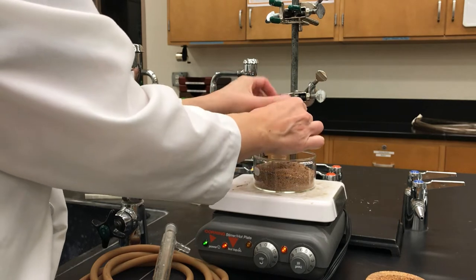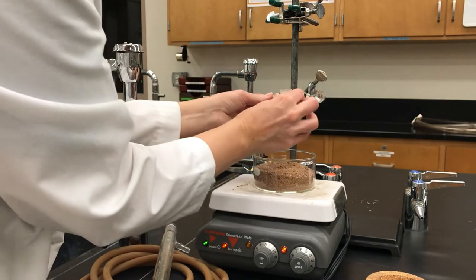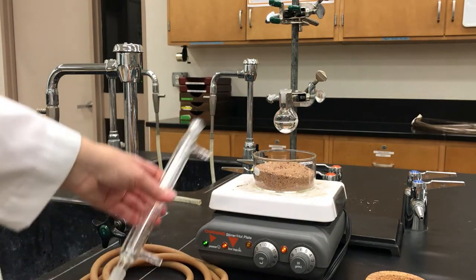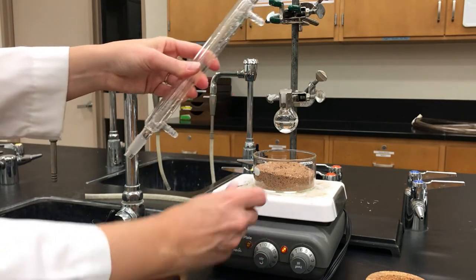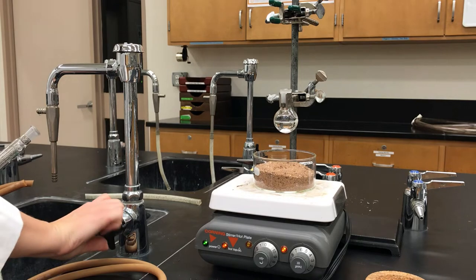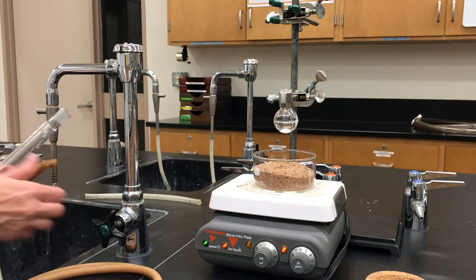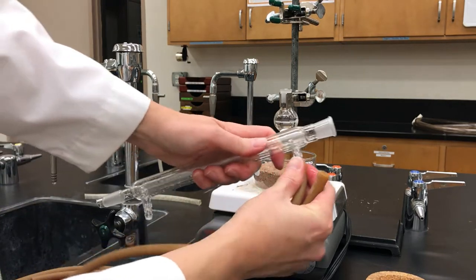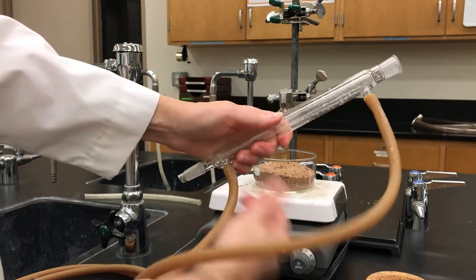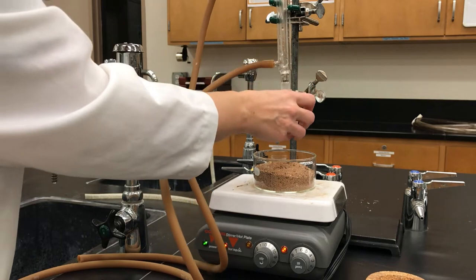You can attach that round bottom flask to a clamp attached to a ring stand, and position that above the heat source. We next need a condenser, and we have to connect some hoses to it. It's easiest to connect the hoses if we first wet the ends. That makes it a lot easier to twist onto the condenser. And then position this condenser vertically atop the round bottom flask.